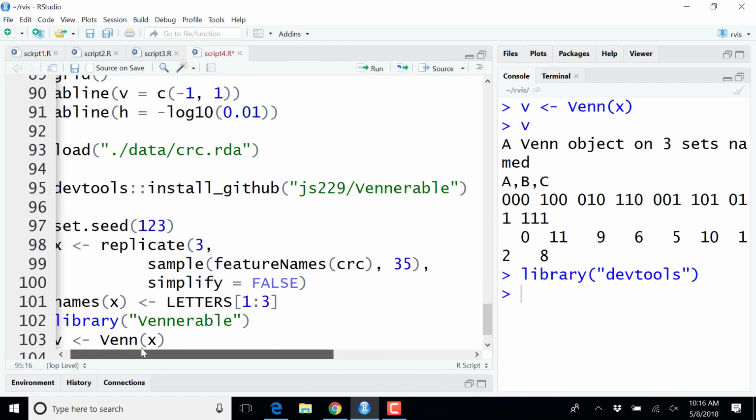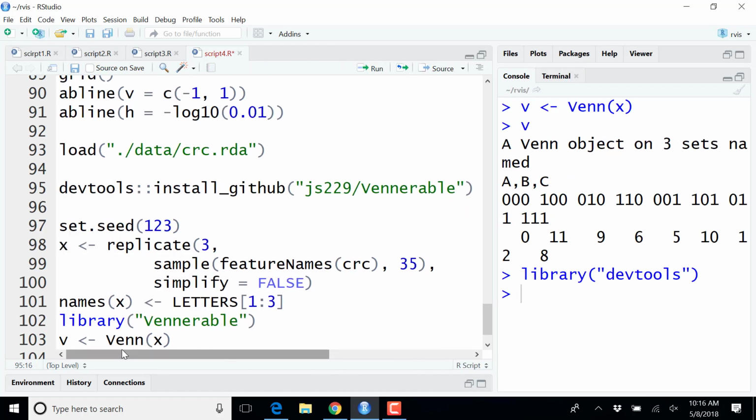Or you can also run the installation script. It's biomolvis_install, and it would install it automatically. But otherwise, if you run this, that is the name of the package, and that is the name of the GitHub user, it will install the package for you.